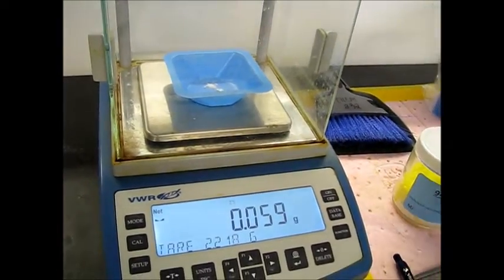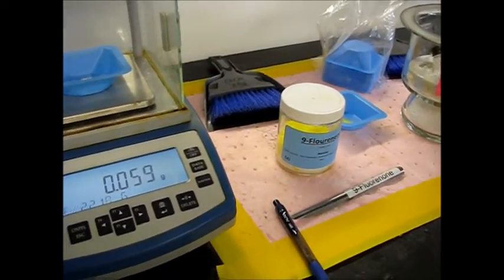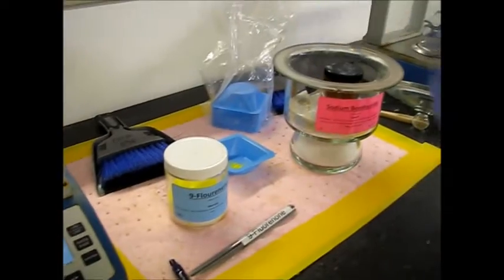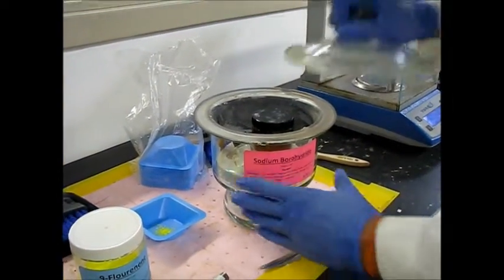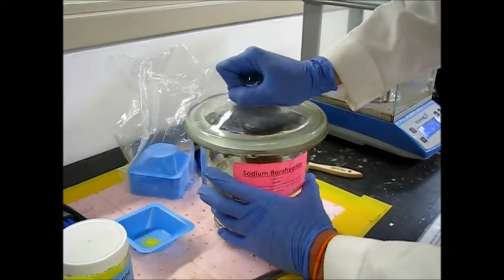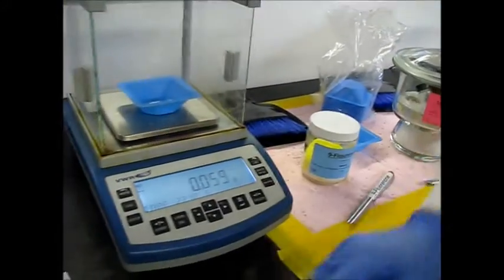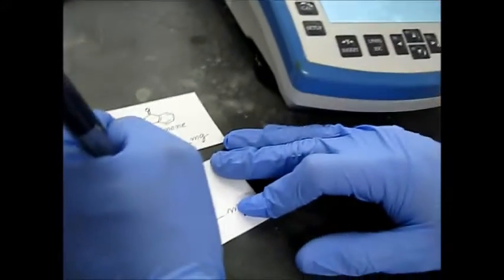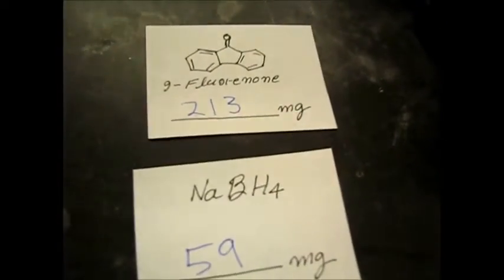All right. So again, we did go just barely over, but it shouldn't be too much. So I'll go ahead and keep this mass, put this back in here, and then we're going to slide our desiccator lid back on. Awesome. I'll go ahead and write down 59 milligrams for sodium borohydride, just so that we don't forget. So these are our two masses for our two reactants.